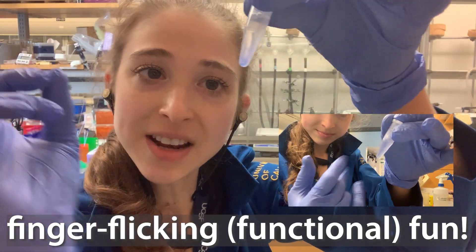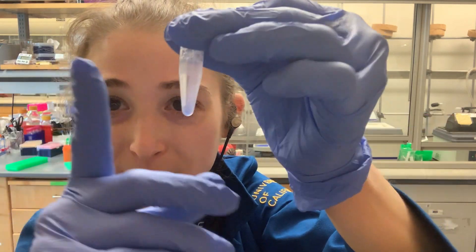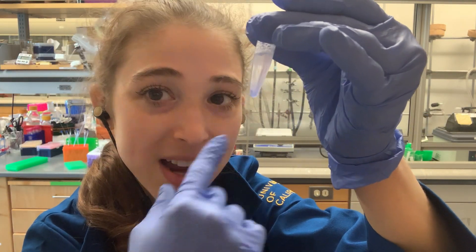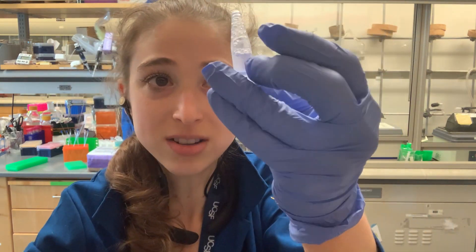You gotta mix — swish and flick — so you don't need the swish, but the finger flick is one of the best ways to mix things inside of a microcentrifuge tube.